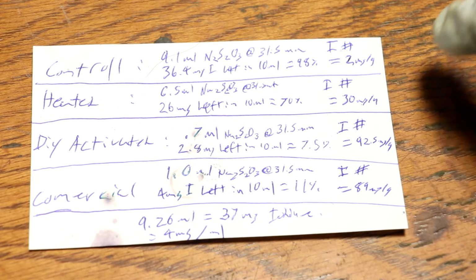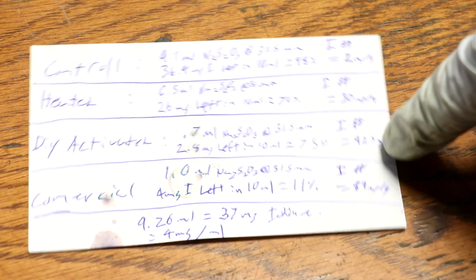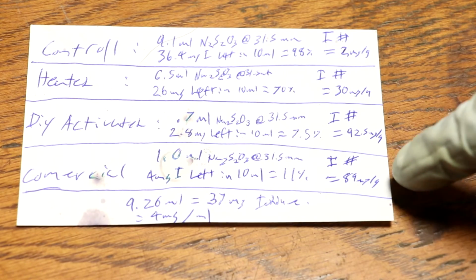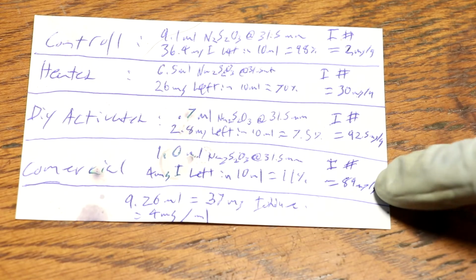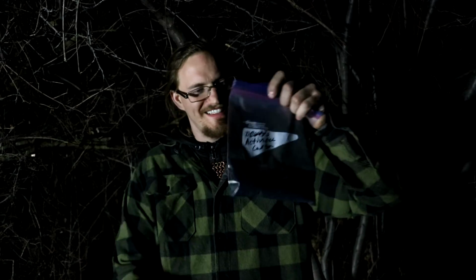Now keep in mind there's probably pretty big error bars on these numbers, but it still shows that I definitely was able to activate it, and to a level comparable to what is commercially available. So there you have it. You now know how to make activated carbon.